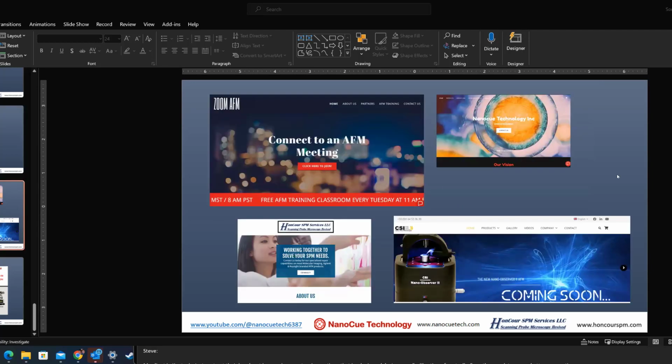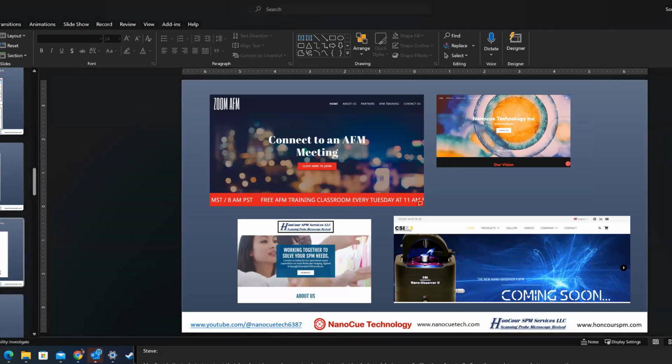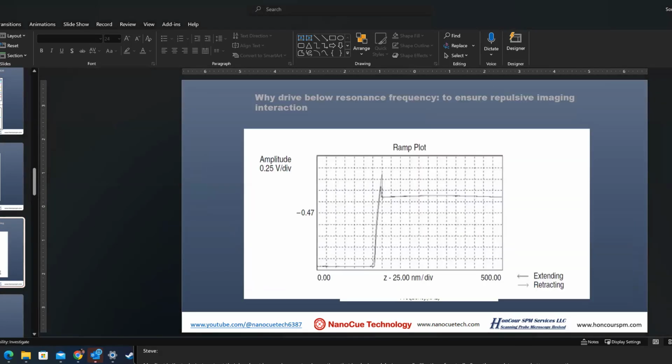Hey, Song, it's Jason here. I guess I'll be the first to ask a question. How much does the water layer come into play with the tapping mode and trying to optimize? Because I think I remember reading somewhere that using a low amplitude keeps your tip in the water layer and helps give you better resolution compared to a higher amplitude that might be jumping in and out.